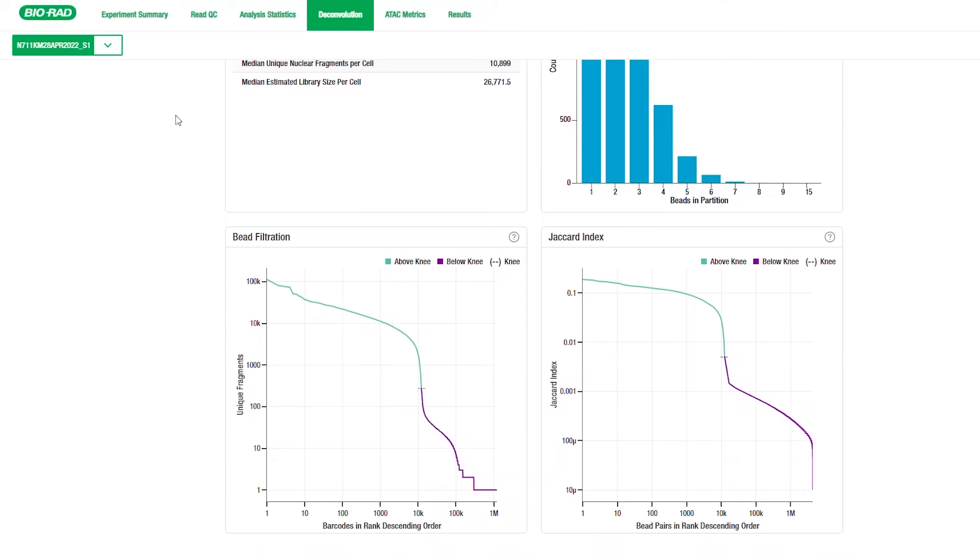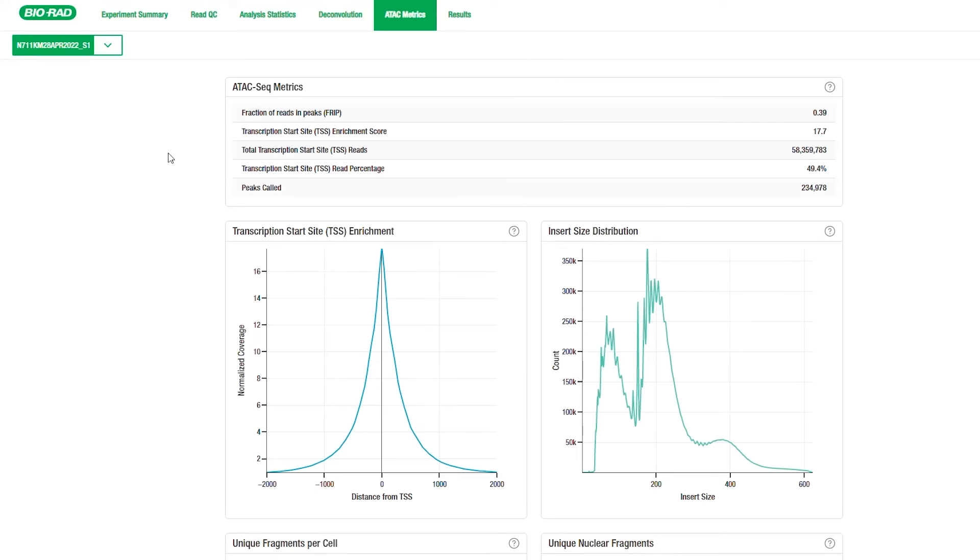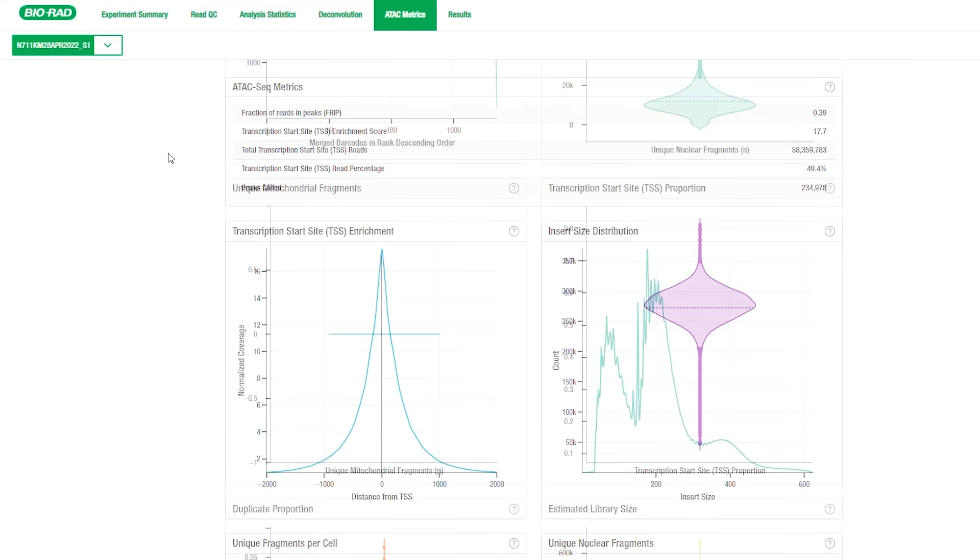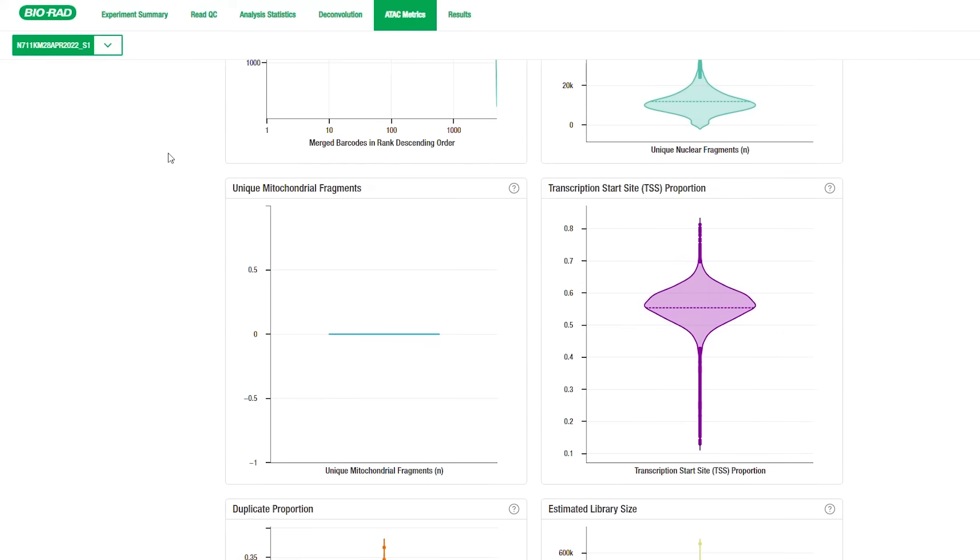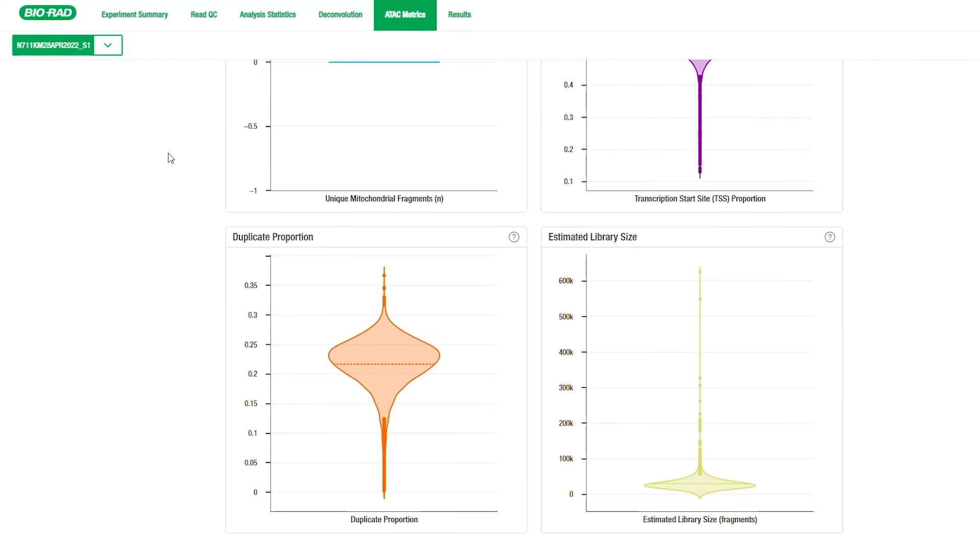In ATAC Metrics tab, you will find information relating specifically to ATAC-Seq results. These ATAC Metrics are reported both in a table and in plots illustrating key metrics including the transcription start site enrichment, insert size distribution, unique nuclear and mitochondrial fragments per cell, TSS proportion, duplicate proportion, and estimated library size. All these metrics are useful when determining if you have high quality data and whether the experiment was successful.